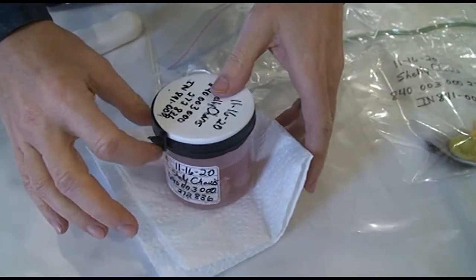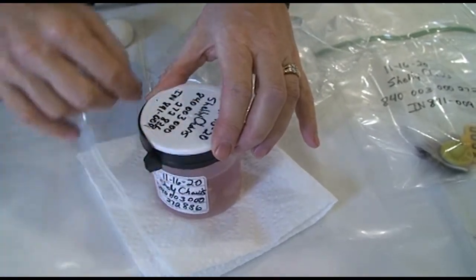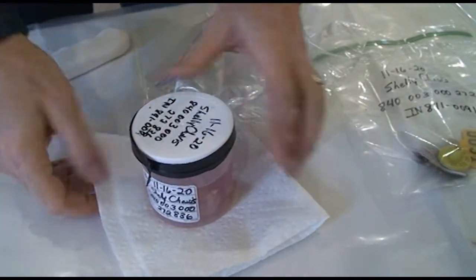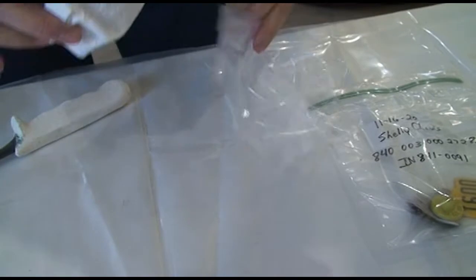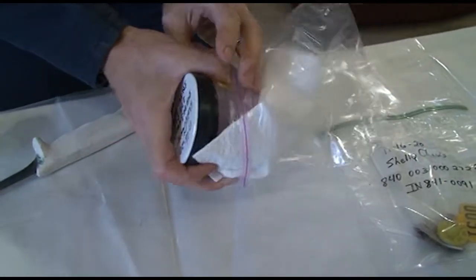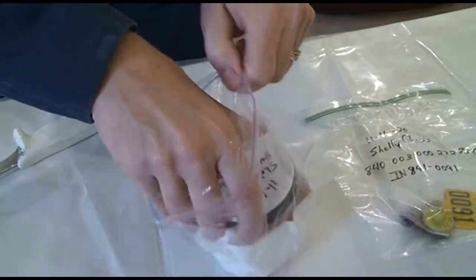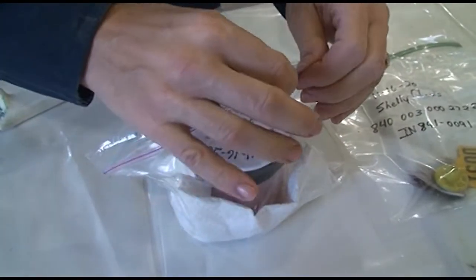And we leave a tab on the electrical tape for the lab to be able to grab it to unwrap it, so they don't have to dig along and try to find the end of that electrical tape. So we put a tab on the electrical tape. We put paper towel under, or some type of absorptive material underneath the formalin jar. And then we put that into a Ziploc bag, and we seal that.